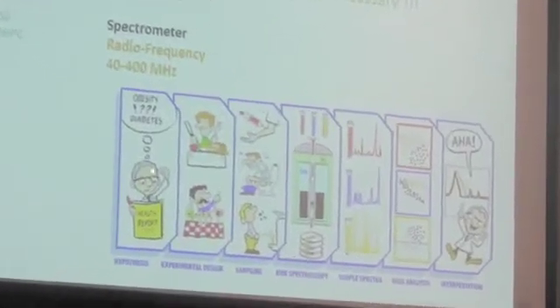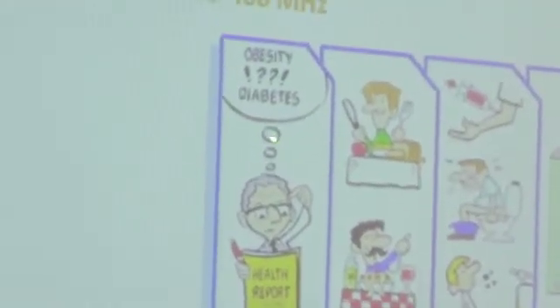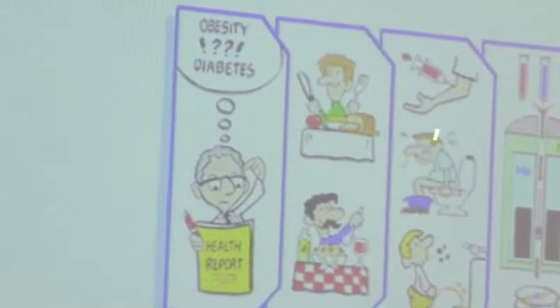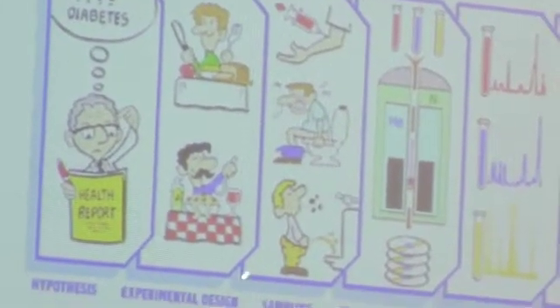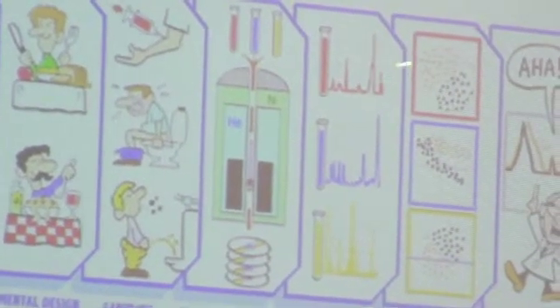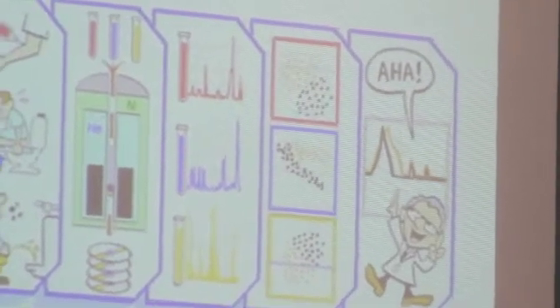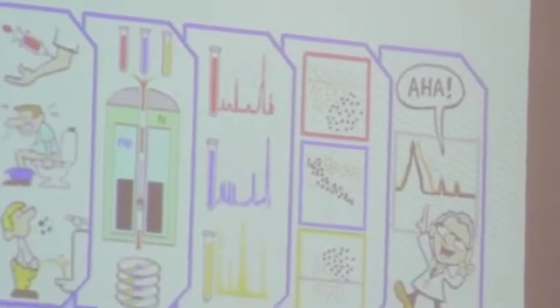And one big thing that people are doing is, this is a little cartoon that I stole, a guy is trying to figure out, if I have a population of people, can I figure out who's obese, who has diabetes? So you have them eat things, and then you either look at blood plasma or fecal matter, which is probably not a fun one to do, or urine, and you can look at the metabolites of the human being. You do the NMR analysis, you get your results for all the different groups, and then you do a pattern recognition mathematical thing to it. And you can figure out, okay, this population has obesity, this population doesn't.